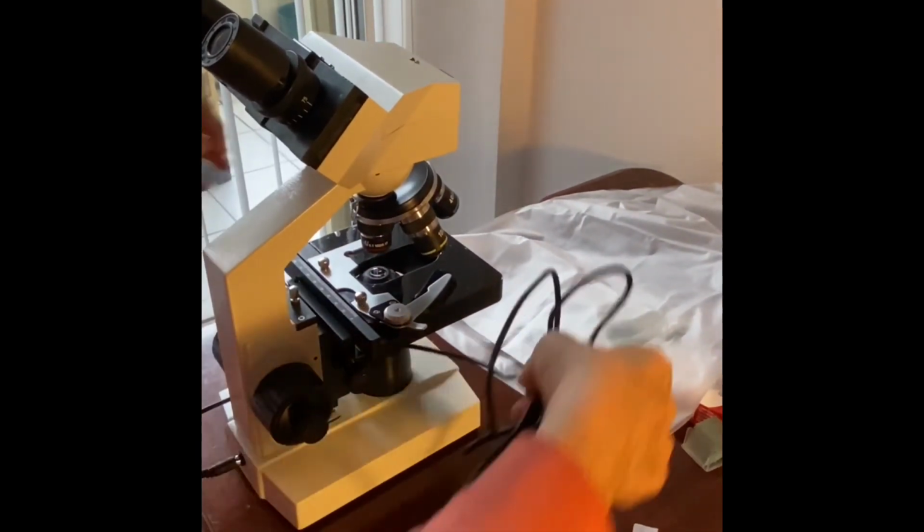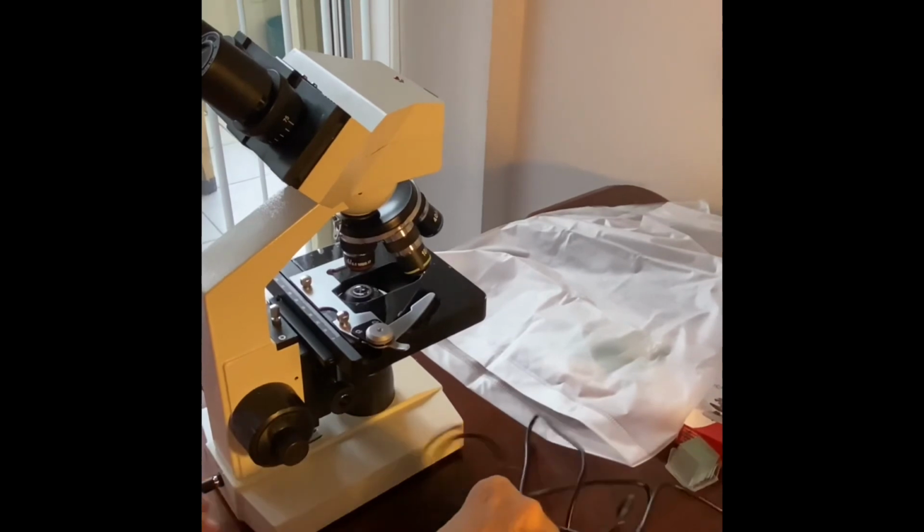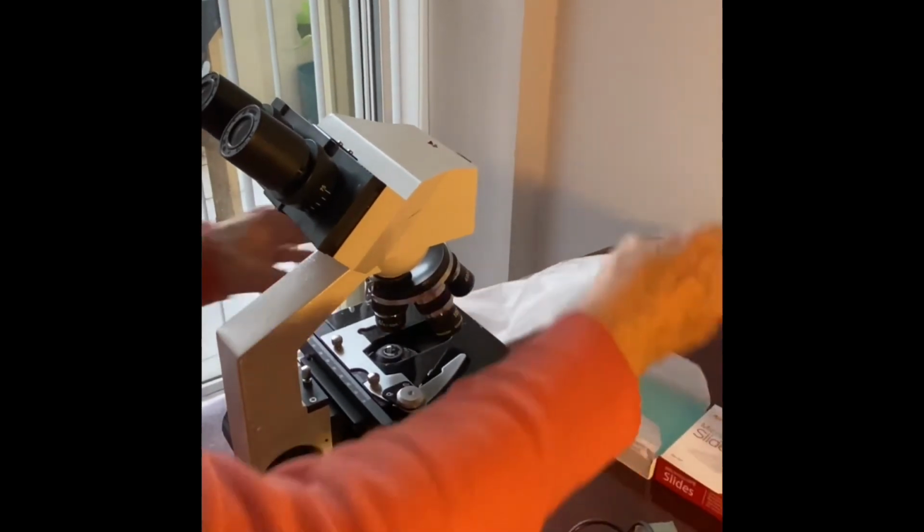So what we have left to do now is put the cover on. The cover will protect it from dust and other particles.